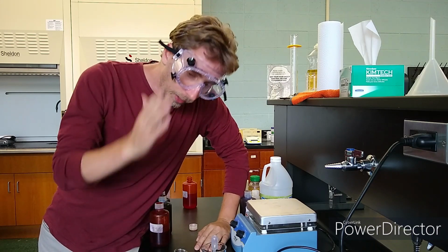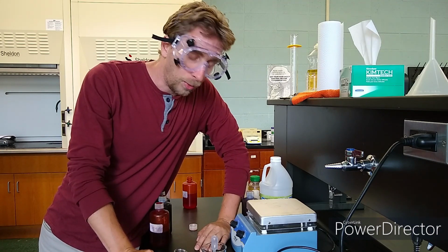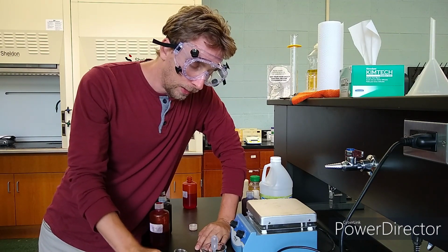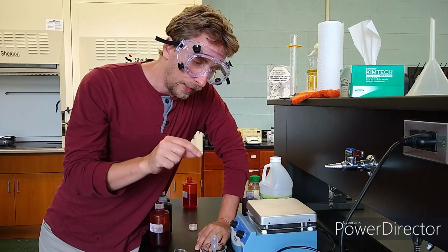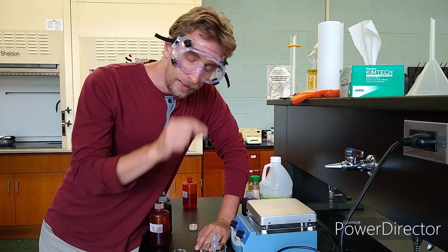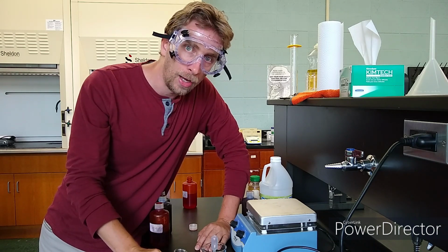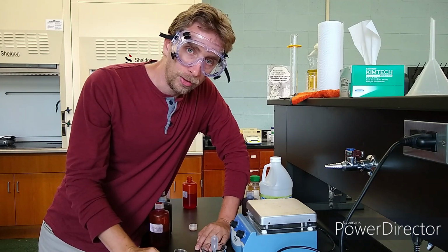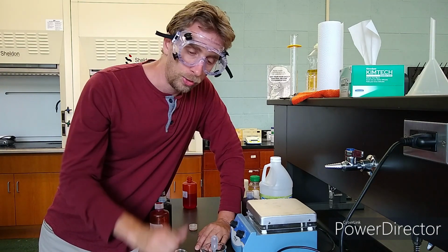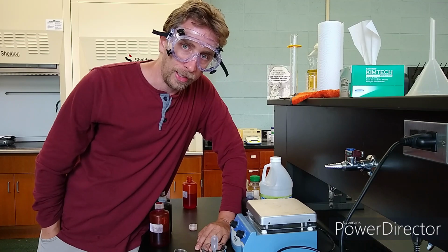So you know what that tells me? That the endpoint, which I'll explain more in the classroom, and we will have another lab towards the end of the term that talks a lot more about endpoints when we do an acid-base titration. This simple check told me that the endpoint for the iodine oxidation of the ascorbic acid is between 20 and 30 milliliters, which is pretty ideal for typical titrations. So I'm going to use the iodine solution and starch solutions that I already had pre-mixed, and that'll save me a nice chunk of time. Glad that we checked this.